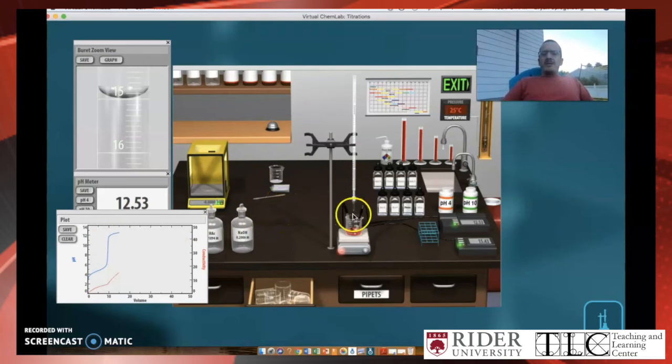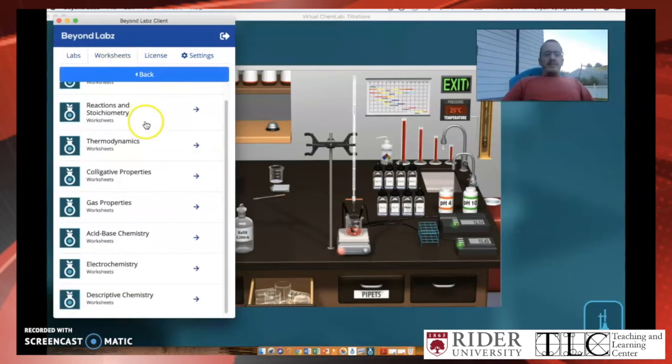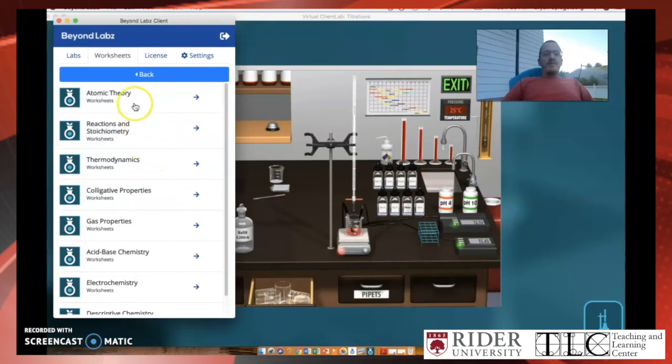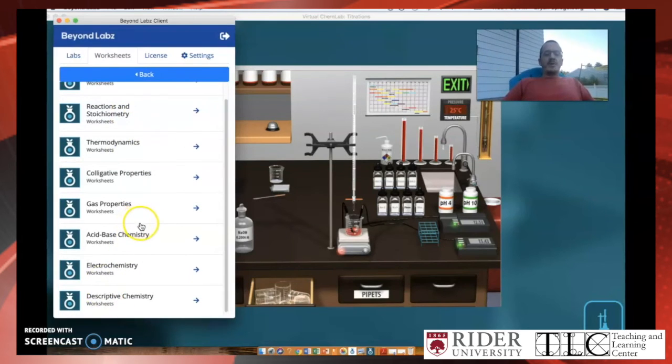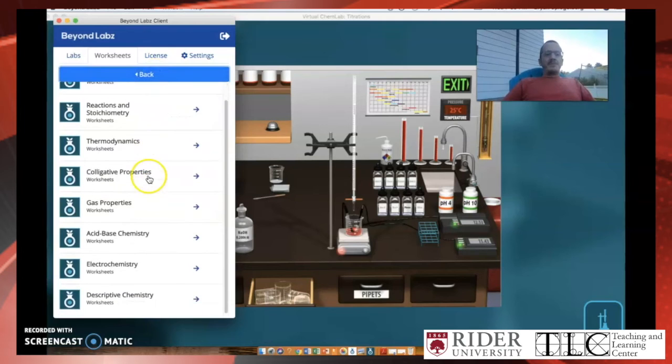It gets students to actually be working with things like weighing stuff out in a virtual reality way, but they're also recording data. So it does have a lot of the things that I would like to see from an actual lab. Like I kind of alluded to, there are some canned labs. There's quite a few different experiments. Some are with the titration lab, some with the quantum lab, some with the inorganic lab, there's a gases lab. There's a whole bunch of labs that they've written out.